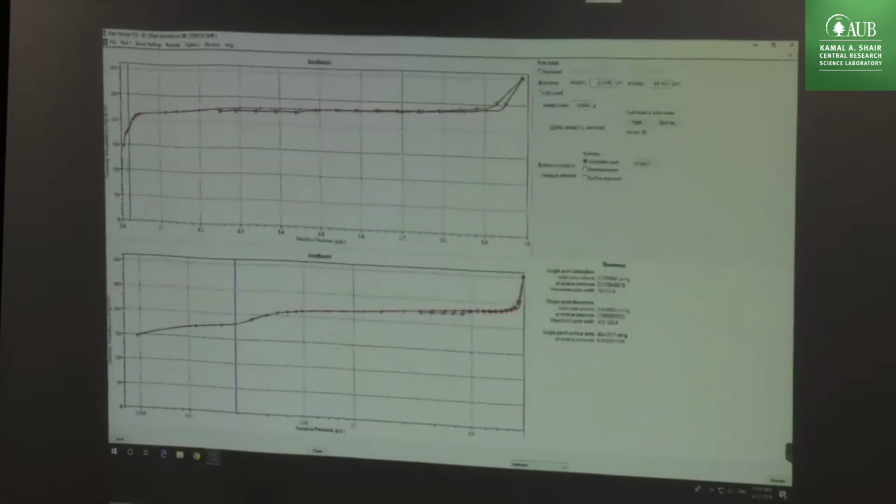The first point is 0.005. This is our increment, this is what we put, 0.005. I will show you now how we print the sample. Yesterday I told you this is the only way I know if I can have points or not, is to have an idea about the volume. If my sample absorbs 0.005 and I put an increment of 0.05, you get adsorption with 1 point only. So normally we need to have an idea about the pore volume.